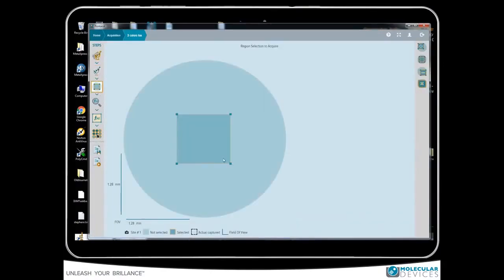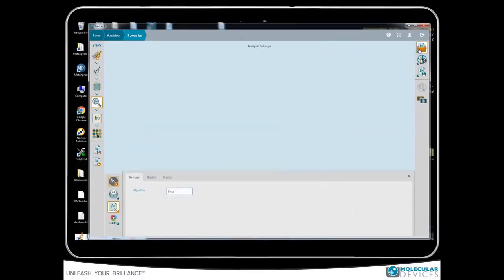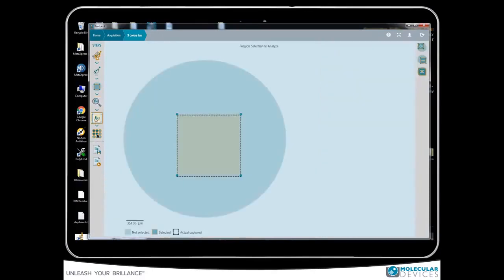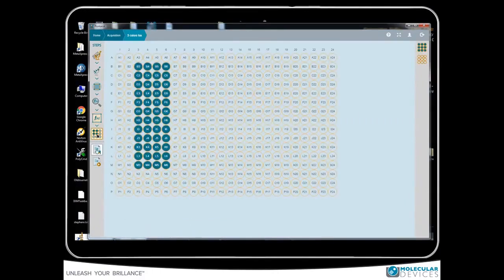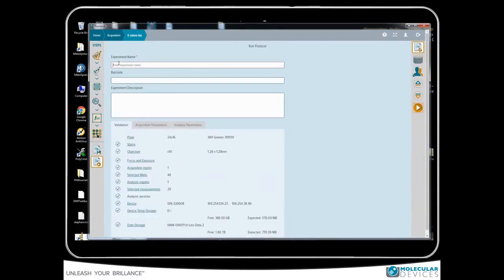You can select or modify the area of your interest. You can set up the analysis on the fly. To set up the analysis, go to the list of analysis templates and select one, for example, cell scoring. The analysis counts and analyzes cells using intensities in different colors. Then you can select the area for analysis. Finally, you can select the wells to acquire. You can save your protocol and create the data file. You may check the settings before acquisition and then hit the Run button.